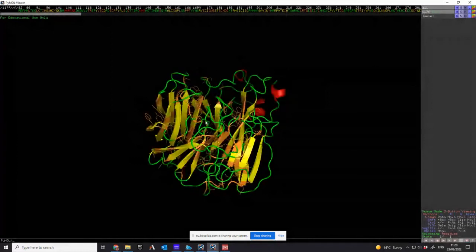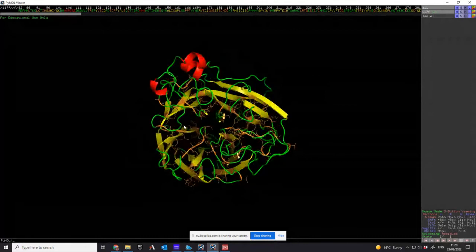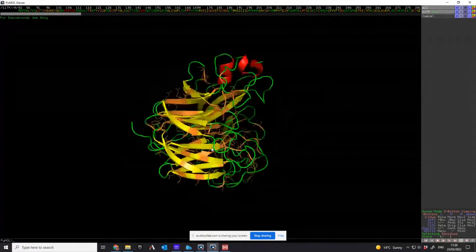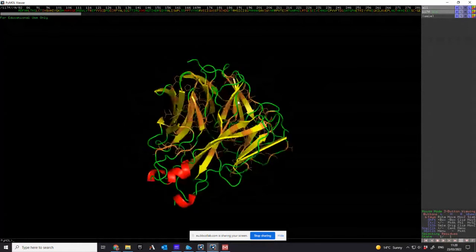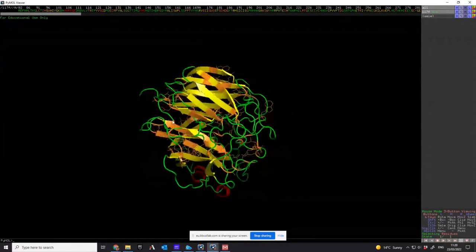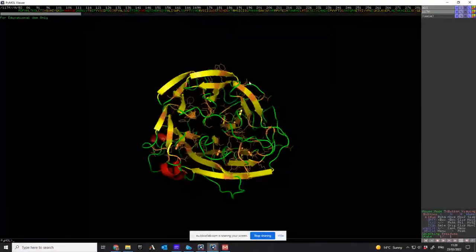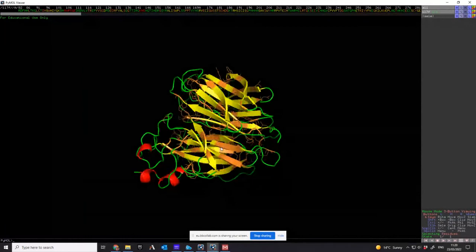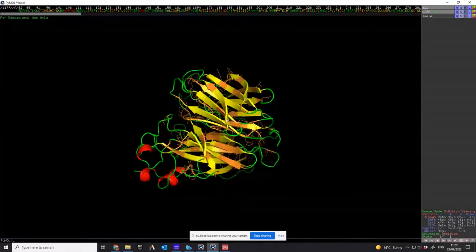That's the complete molecule with all of the highlighted amino acids that are conserved between both of the protein structures. So you see those in orange. You see that most of them fall in the center of this beta sheet. So this has to be conserved because it's the middle of the protein.